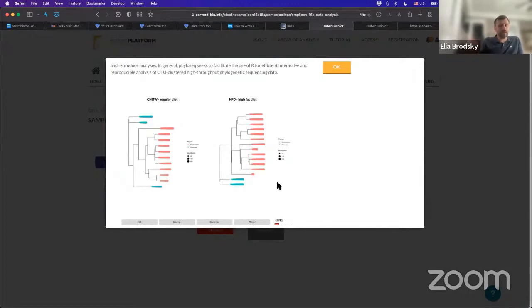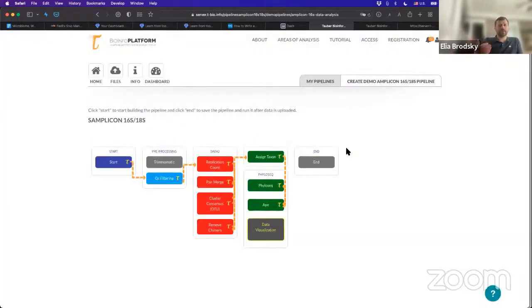Again, we will go through these packages during our sessions, and we can use them in R or we can use them on the platform. But what they do is integrate the statistical analysis with plotting, and we will see how this plotting helps us understand what kind of data we have.